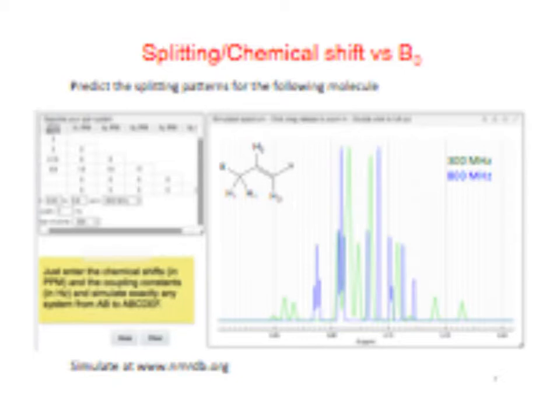And then I put in the chemical shifts, 3 and 3, these 2 are the same. And then I made it 5.75 and 5.8. For H2 to H1, there's no coupling between these 2. So this would actually be 1, 2, 3, 4 in this.